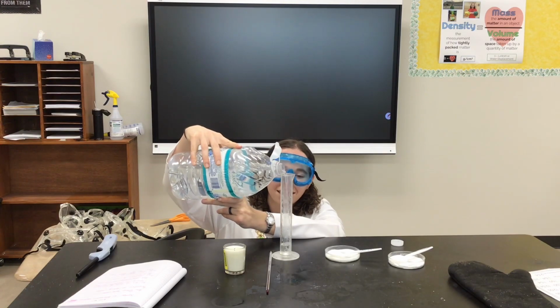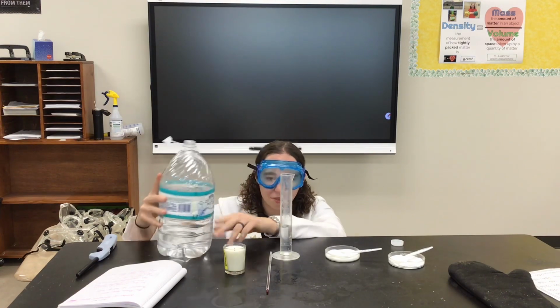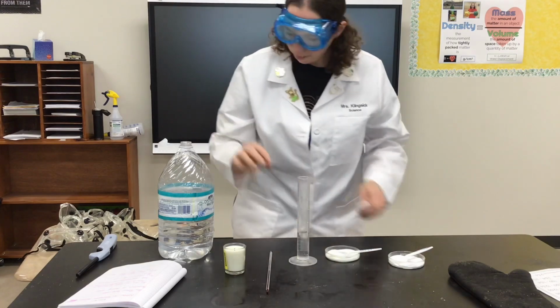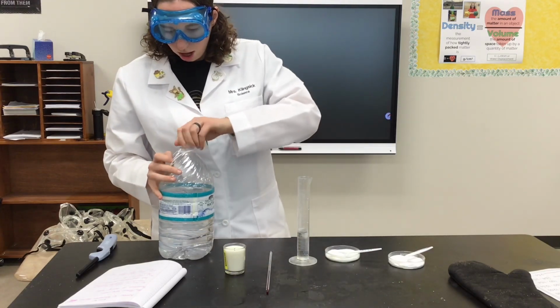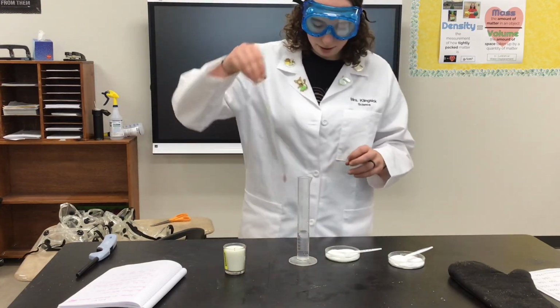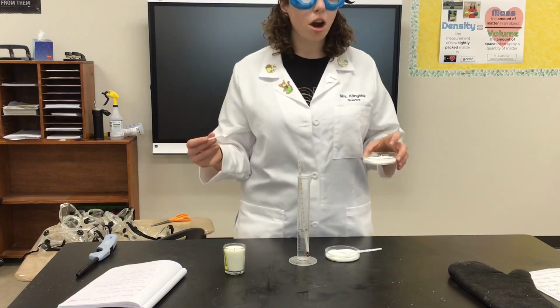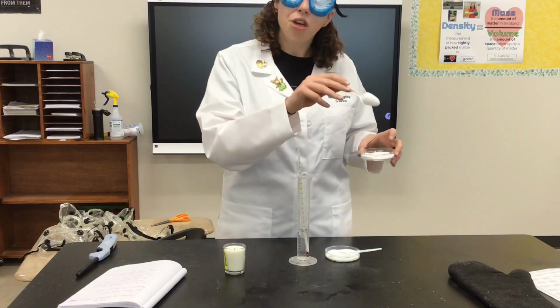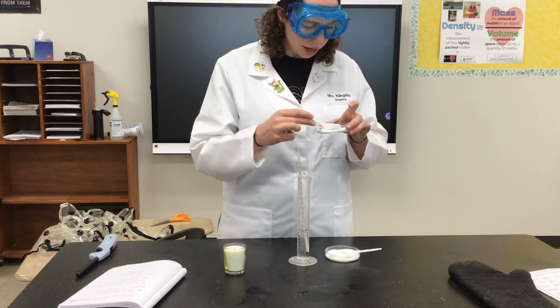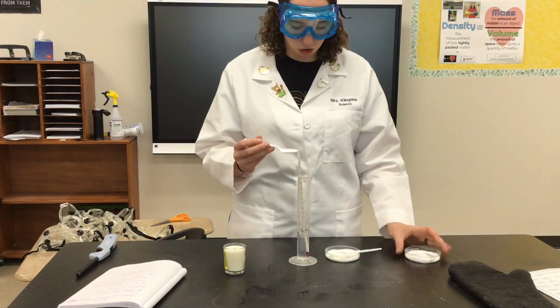There it goes. There we go. It's about 40. Okay. Then what I'm going to do is put my thermometer in. I'm going to add some sodium bicarbonate. Now, sodium bicarbonate is actually baking soda. In the cooking video we watched earlier this week, we talked about sodium bicarbonate, but it is a chemical. And so what we're going to do is add this into the water and see if anything happens. Again, we're looking for chemical changes.